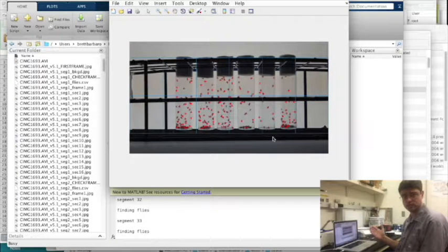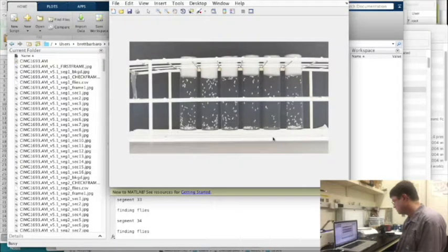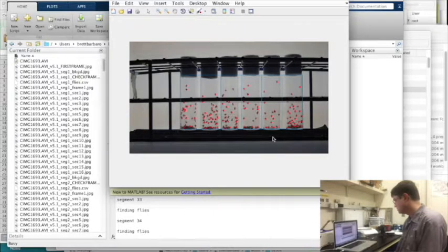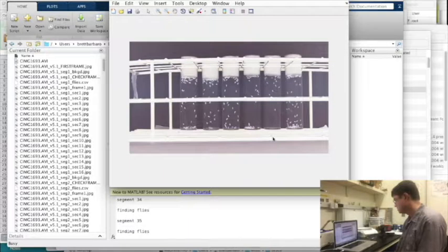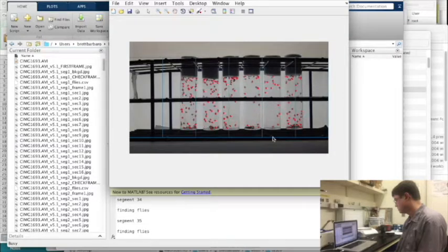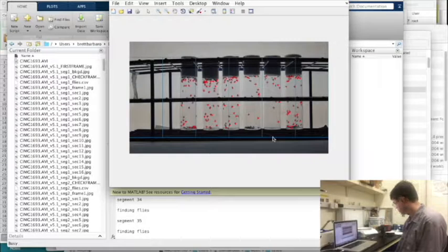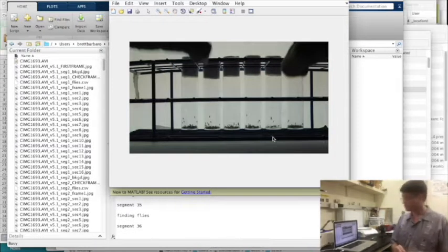Such as this one. Alright, so it is working. Should be done pretty soon, I think. We'll have 10 segments that were no good in the beginning.